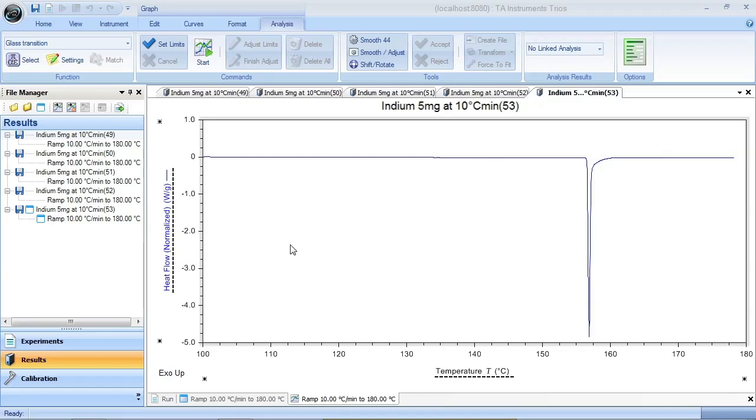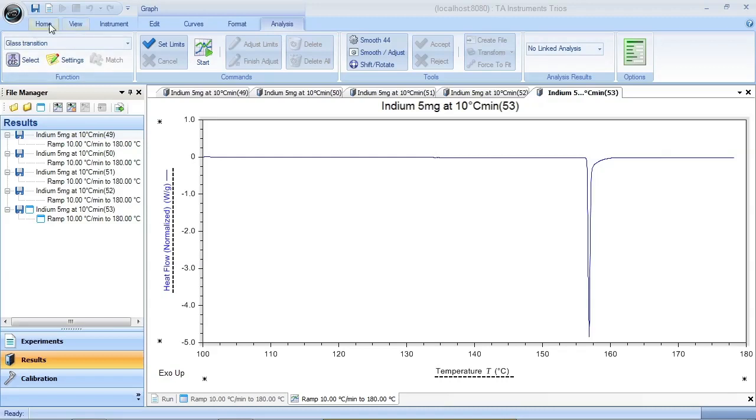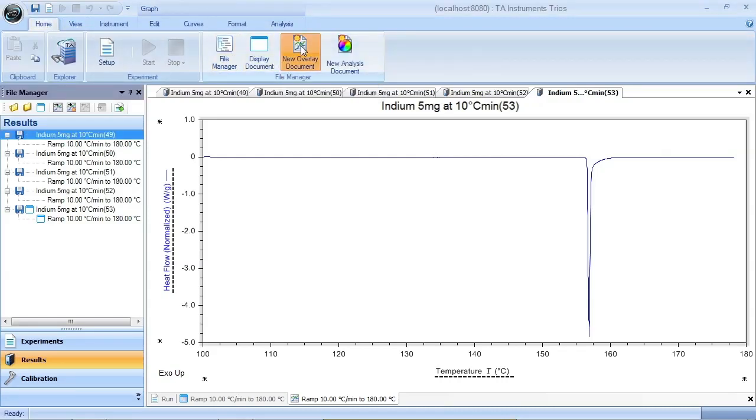I'm going to create an overlay document by going to the Home ribbon, click right here, and then click New Overlay Document right here. Now I have a new overlay document. It's a standalone TRIOS document. It can be saved just like any other file.